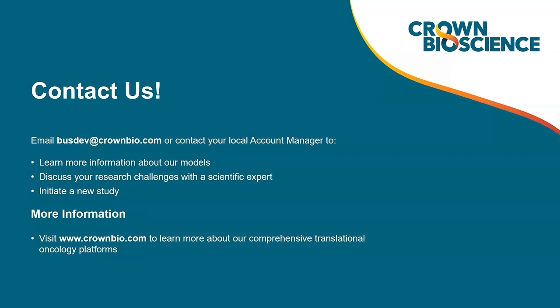Thank you very much, Dr. Mao, for that presentation. We have received a few questions from the audience, and I will start with the first question right now. Will the additional step of using the mouse depletion kit affect the global phosphorylation status?